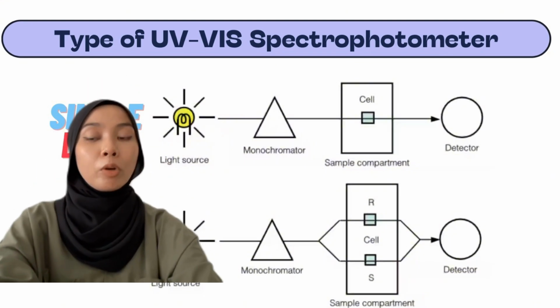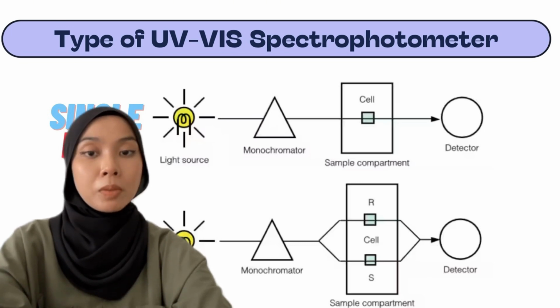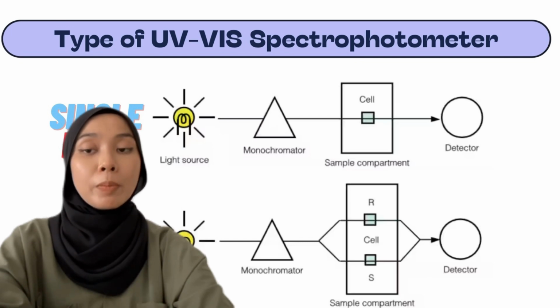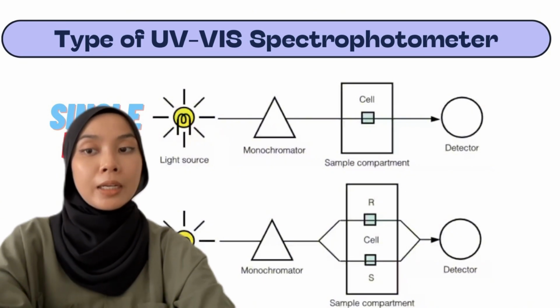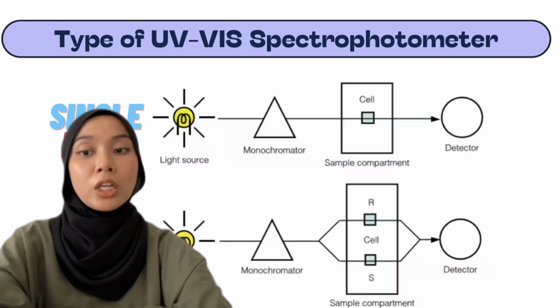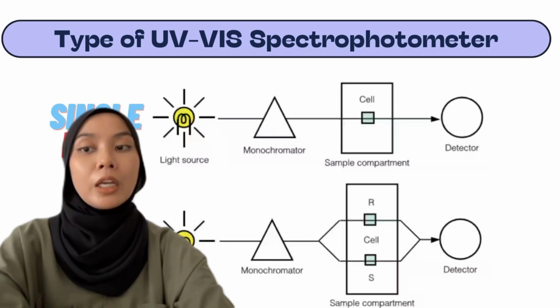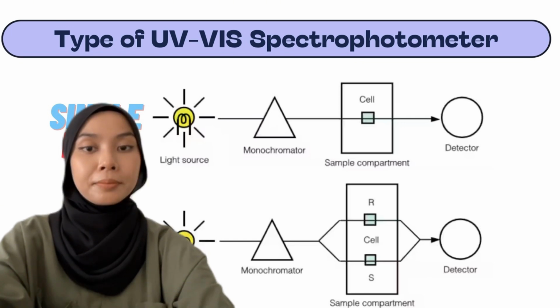So, the single beam configuration has a simpler design because it does not need any mechanism for splitting into sample and reference beams. I would say double beam spectrophotometers are most favorable because firstly, they can read sample and reference cells simultaneously. Secondly, they can compensate for any irregular wavelength changes from radiation sources. They also allow continuous absorbance wavelength spectra recording.